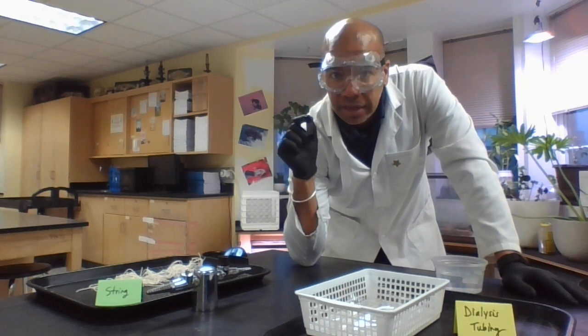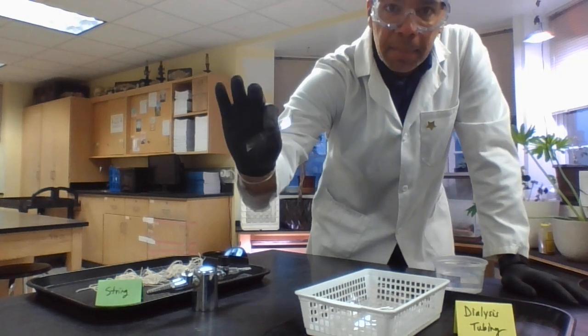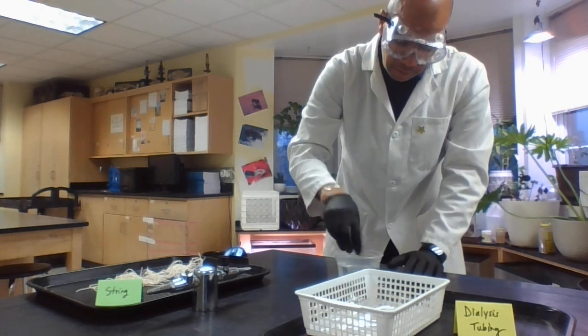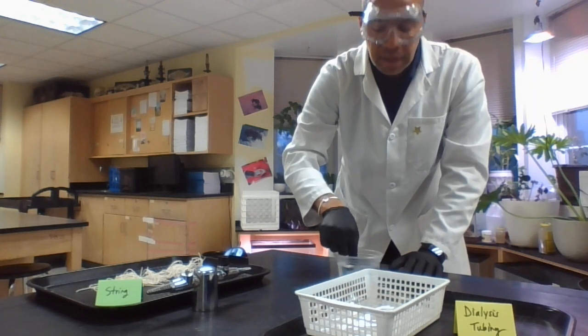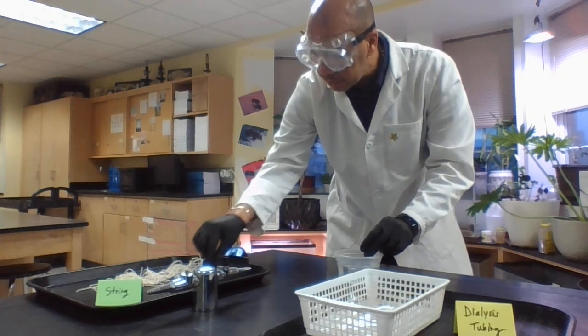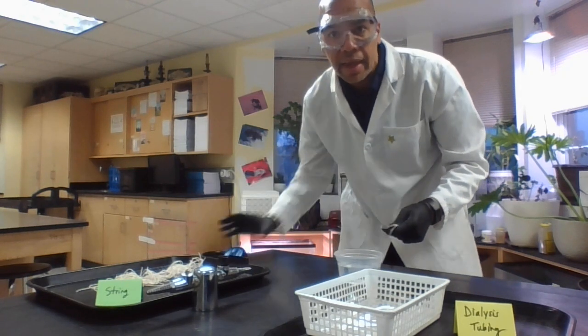So we're going to use this. It actually is a bag. It's a tube, but right now it's flat, looks like a piece of tape. What you're going to do is dump it in the water and let it soak for about 10 seconds or so, and grab 2 strings and go back to your table. Okay, so I'll see you in a sec at your table.